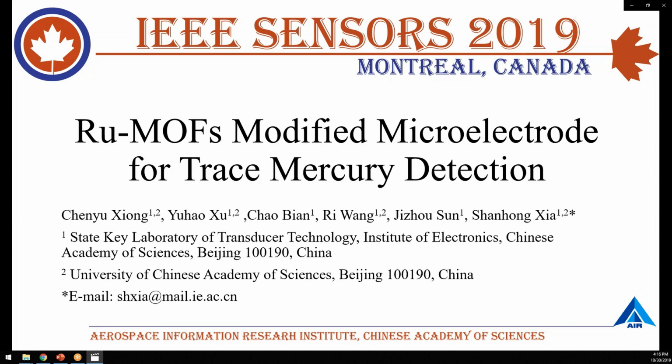Today, the topic of my presentation is Ru-MOFs modified microelectrode for trace mercury detection. By the way, Ru-MOFs will refer to the ruthenium-based metal organic framework.